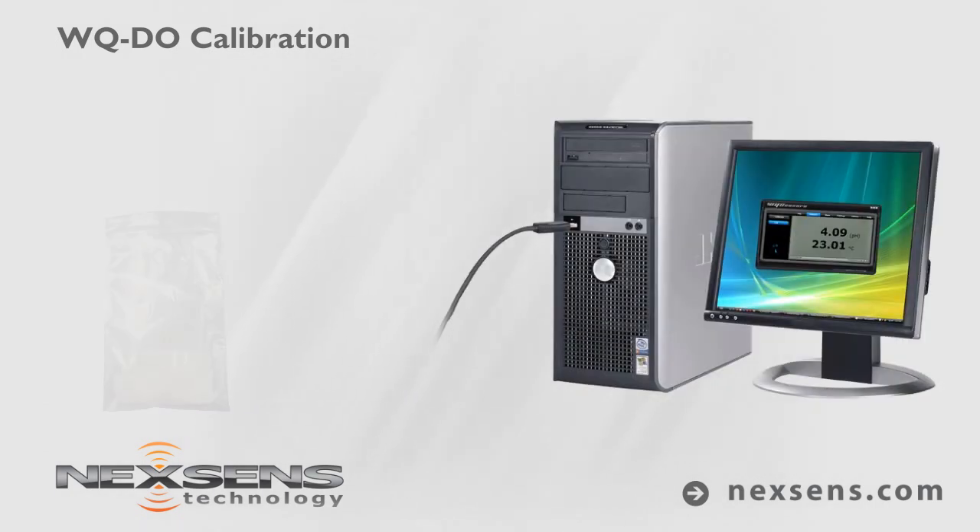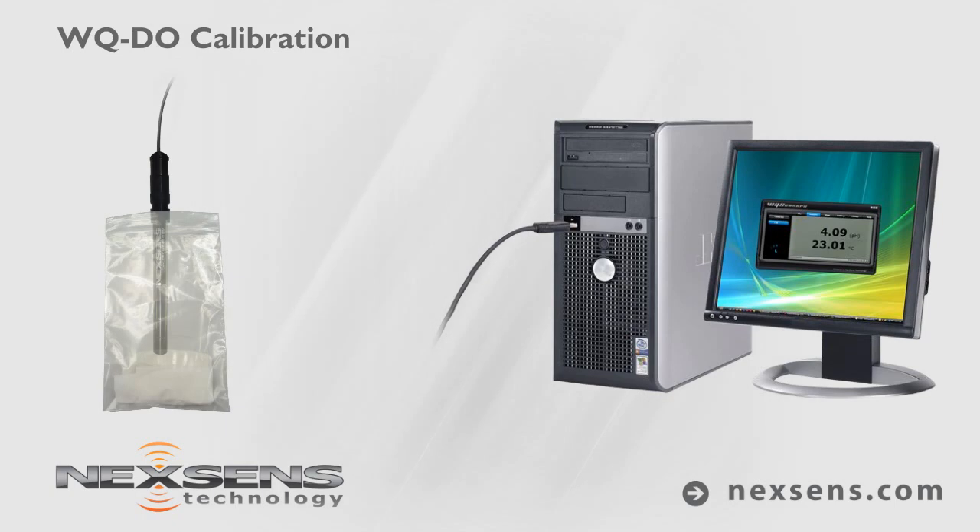With the sensor connected to your computer and the software running, position the probe in a water-saturated, high-humidity air environment. A plastic bag with a wet paper towel will suffice.